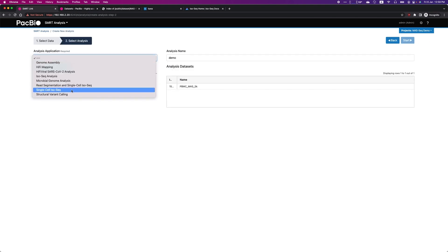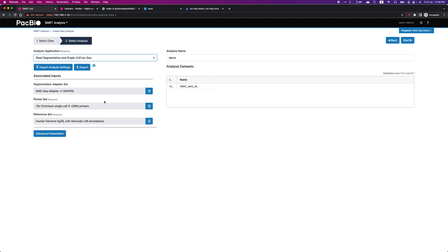And select Read Segmentation and Single-Cell isoform. All the default options will be filled automatically for you. If you are using mouse genome, you will have to change the reference set.